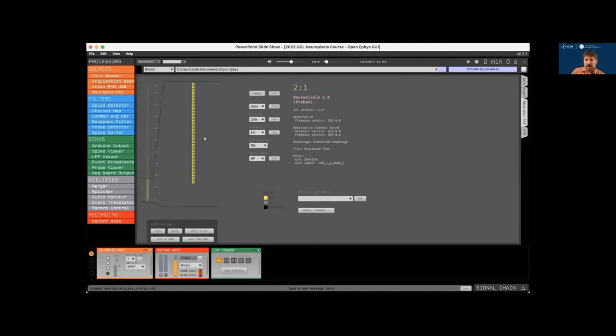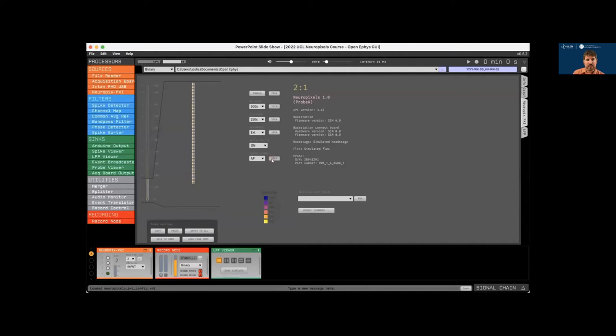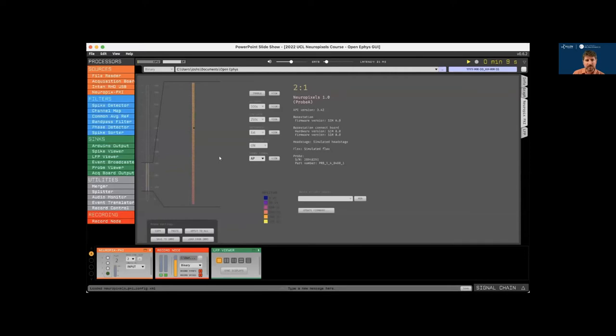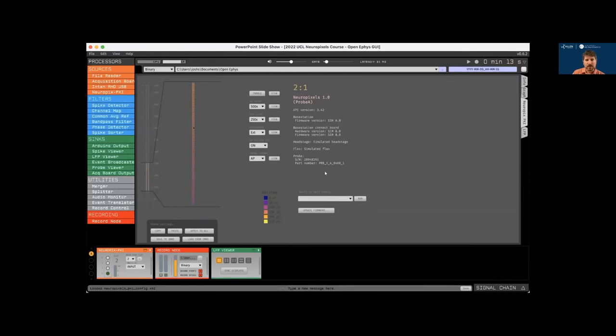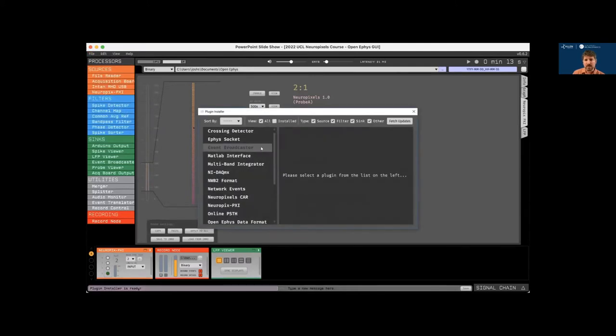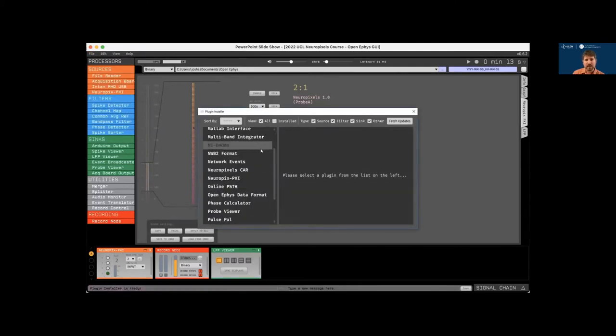The interface in the center allows you to change the AP band gain, the LFP band gain, or switch the reference between external and tip. If we activate the probe signal view and start acquisition, we can now visualize data as a heat map along the length of the probe. And obviously this is simulated data, but if this were a real experiment, it would allow you to view the relative amplitude of the signals across active electrodes. So let's pause acquisition and open up the plugin installer accessible via the file menu.